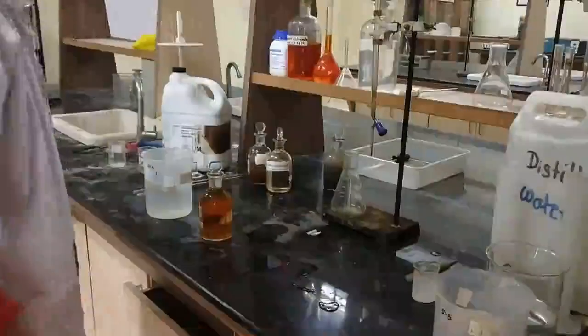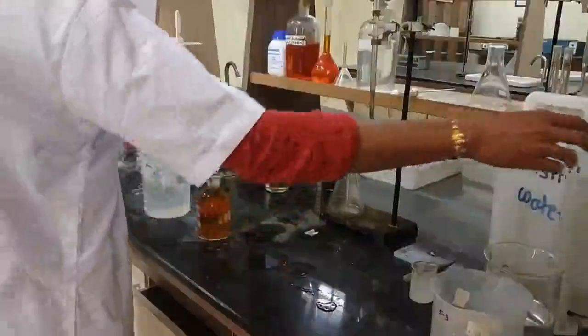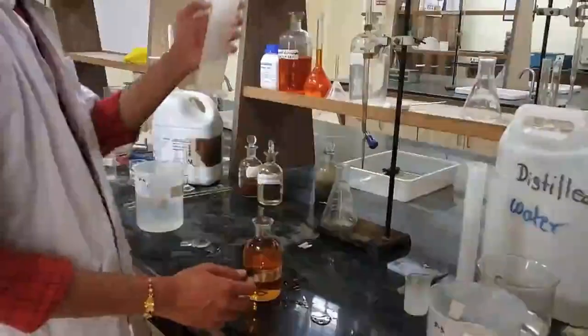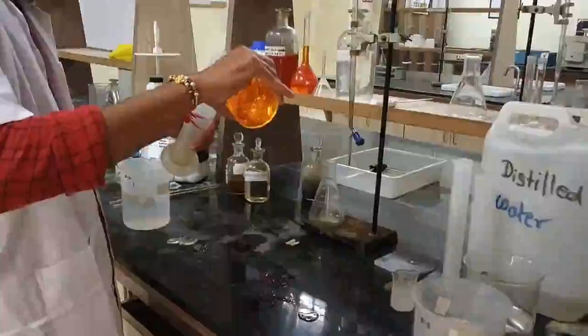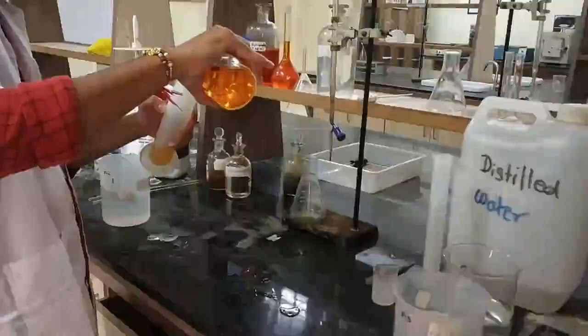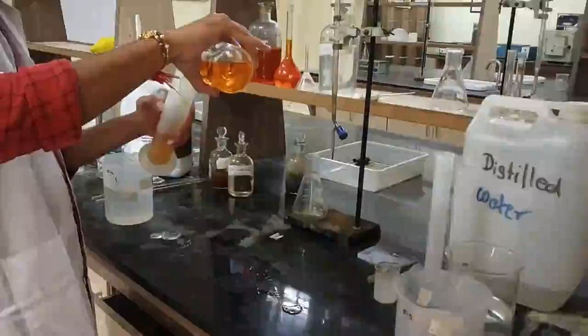Now next step is we have to take 200 ml of sample. Take a 250 ml measuring cylinder and measure 200 ml properly. It should be properly taken so that no turbulence is created, otherwise the turbulence will add excess of oxygen. So fill the cylinder properly to 200 ml.